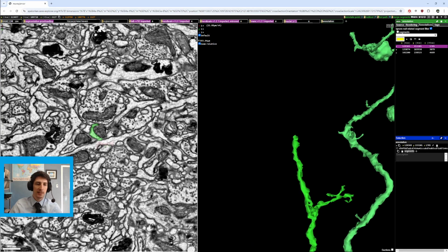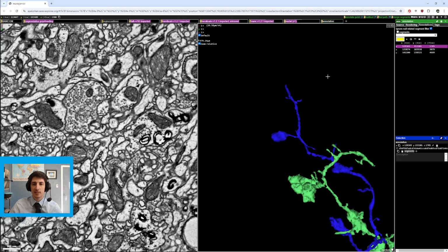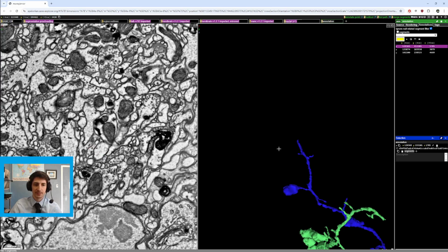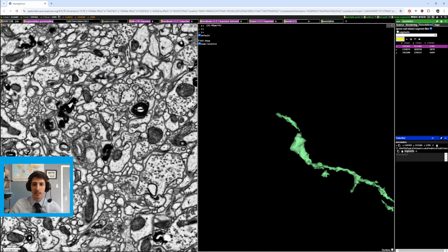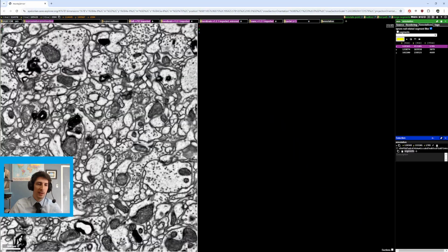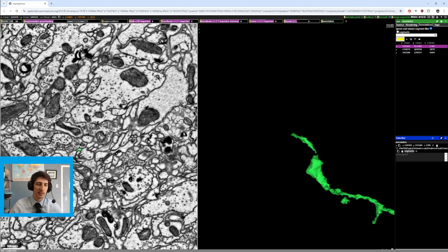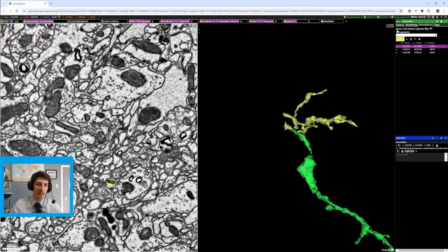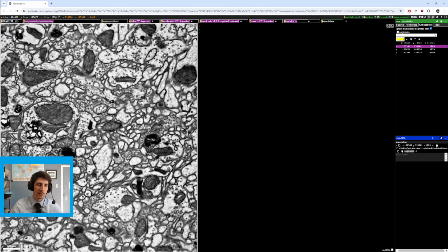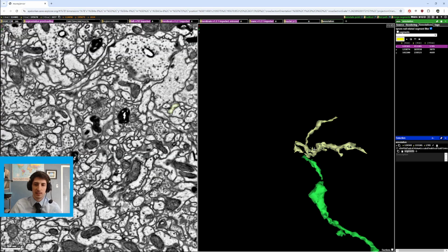Do the same thing again. It's like it goes to here. And this is looking much thinner now, so I don't think we're going to get much more from this branch. I would guess this is probably the end, or enough of a branch that we probably don't need to get any more of it before it's becoming quite small. Looks like we maybe could trace to this yellow one, and then yeah, it's kind of done.